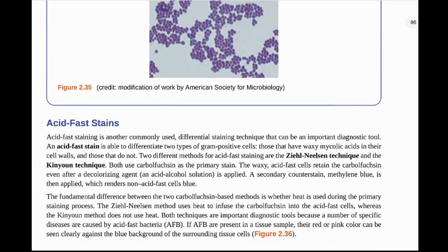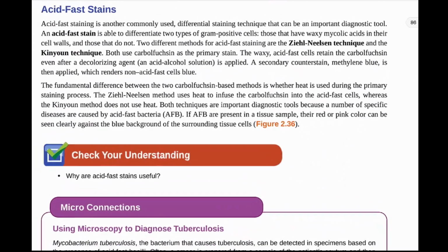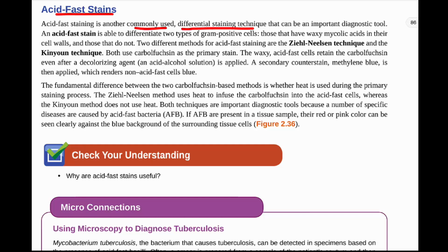So, moving on to our acid-fast stains. So that was our gram stain. Now we're looking at the acid-fast stains. So acid-fast staining is another commonly used stain. It's a differential staining technique, again, not simple staining, but it differentiates between things. It can be an important diagnostic tool. So an acid-fast stain is able to differentiate two types of gram-positive cells.